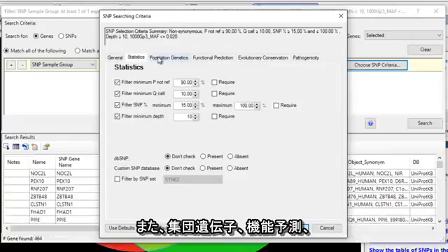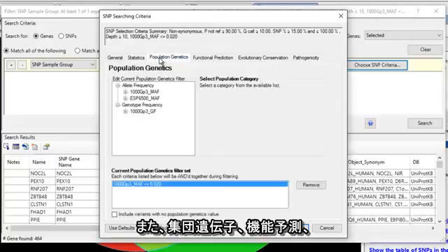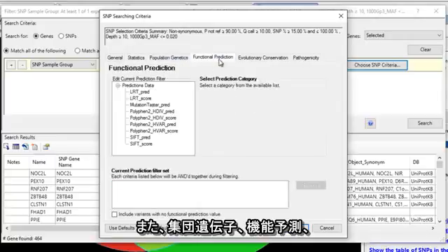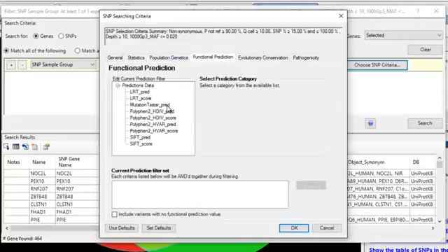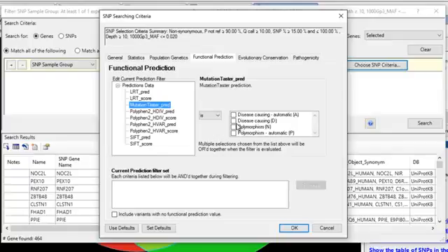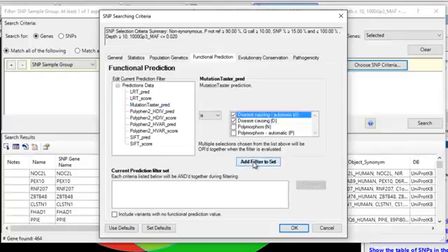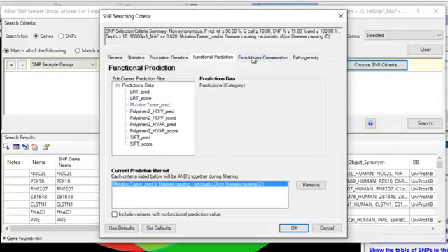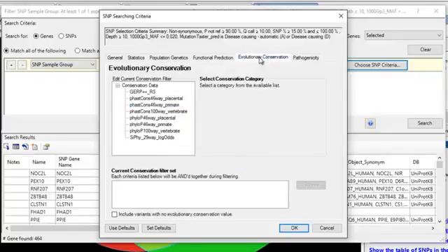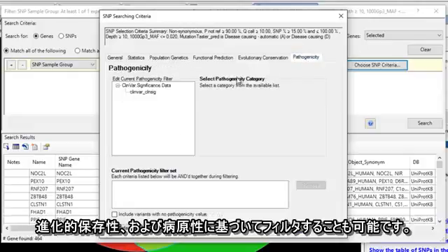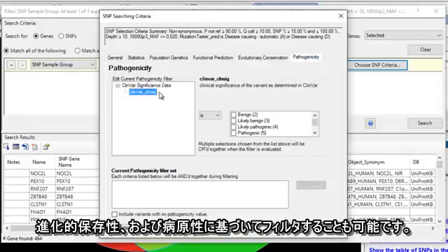You can also filter on population genetics, functional predictions, evolutionary conservation, and pathogenicity.